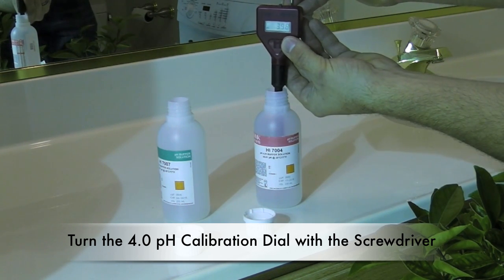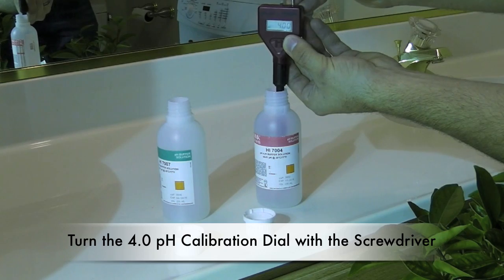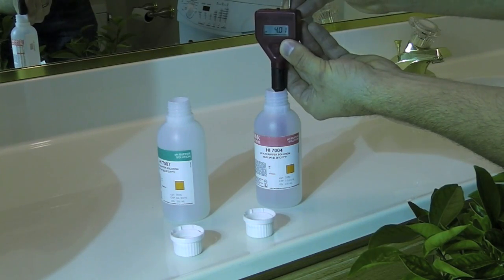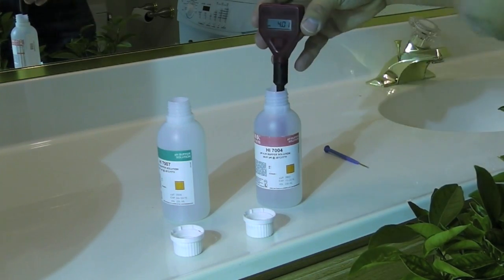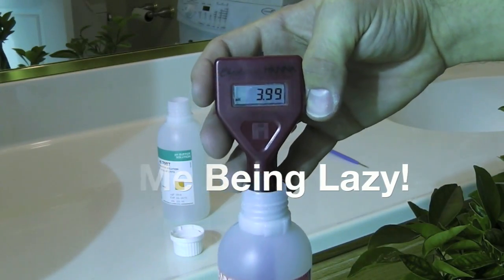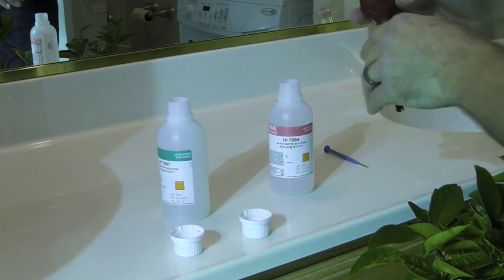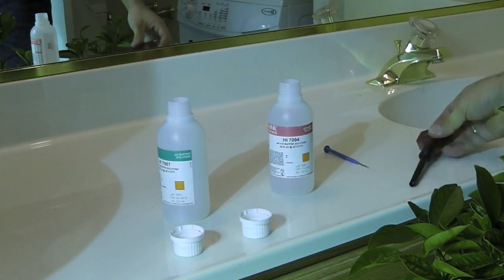Again, the bottle says 4.01, so I'm going to put it in. So that's pretty close.